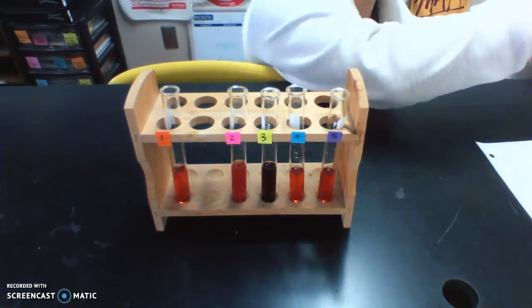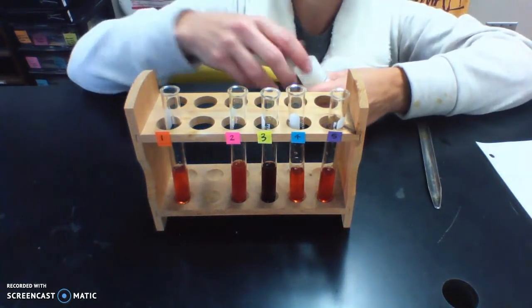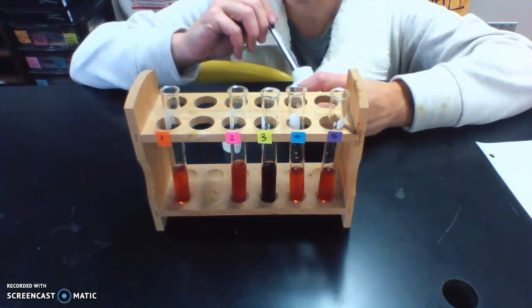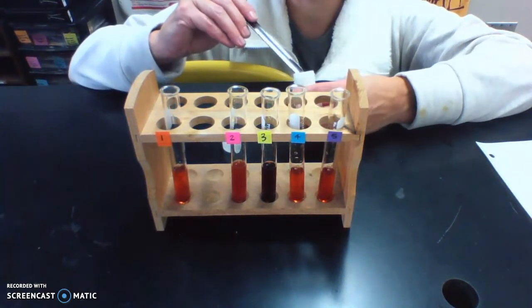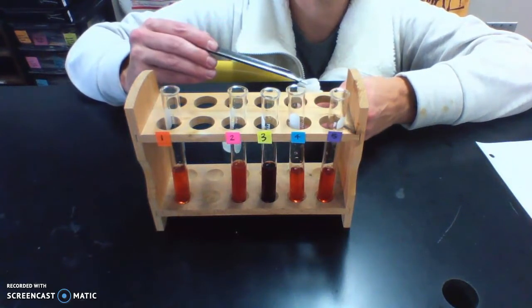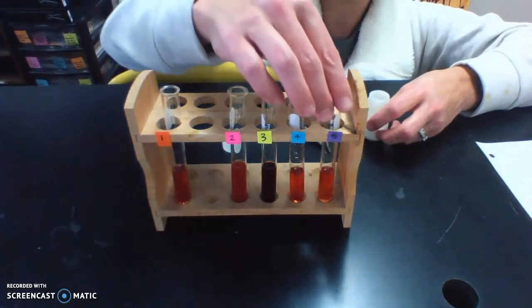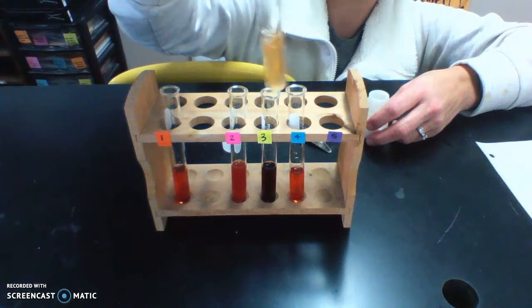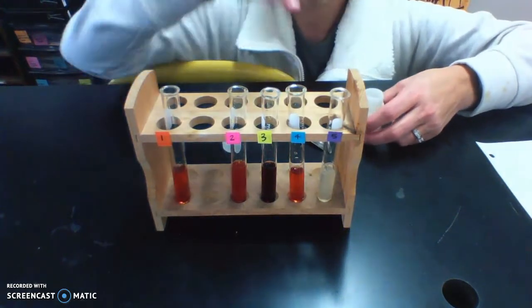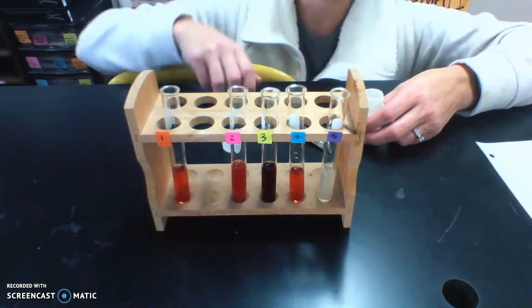Okay, so then how about something which doesn't seem to have any part in the reaction that I wrote? This one is sodium phosphate monobasic, and I believe the equation is in the procedure. So if I add a little bit of this, see if that makes a change. Ooh, and we have a change here. Totally changed color. So that must have shifted the opposite of these three. So if you know which way these went, you should know which way this one went, the opposite way.